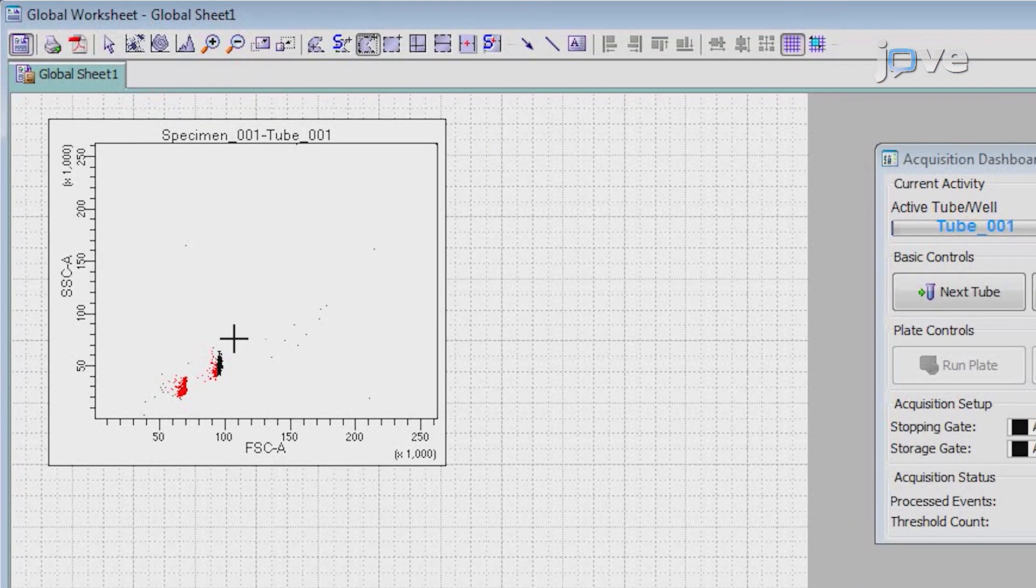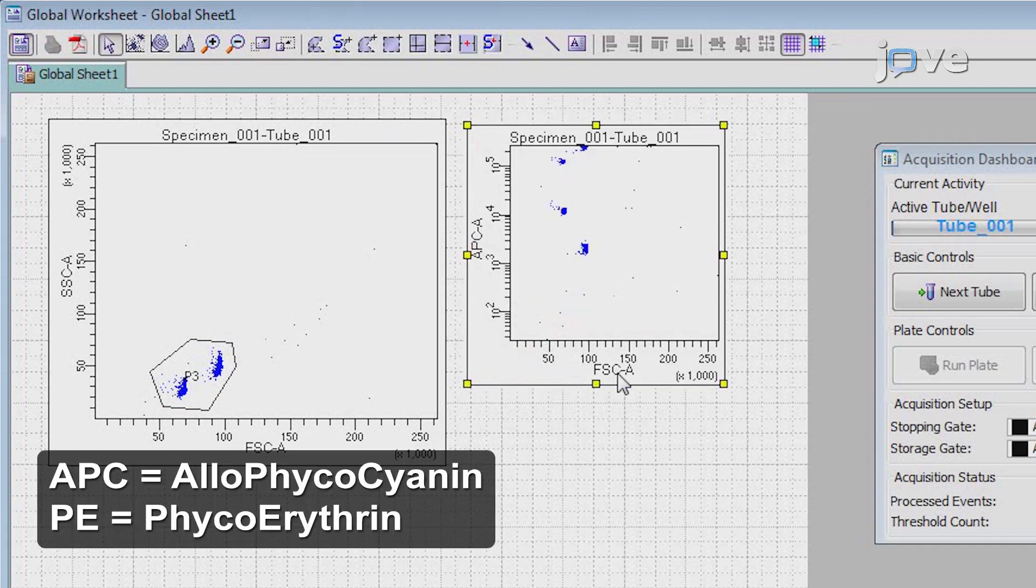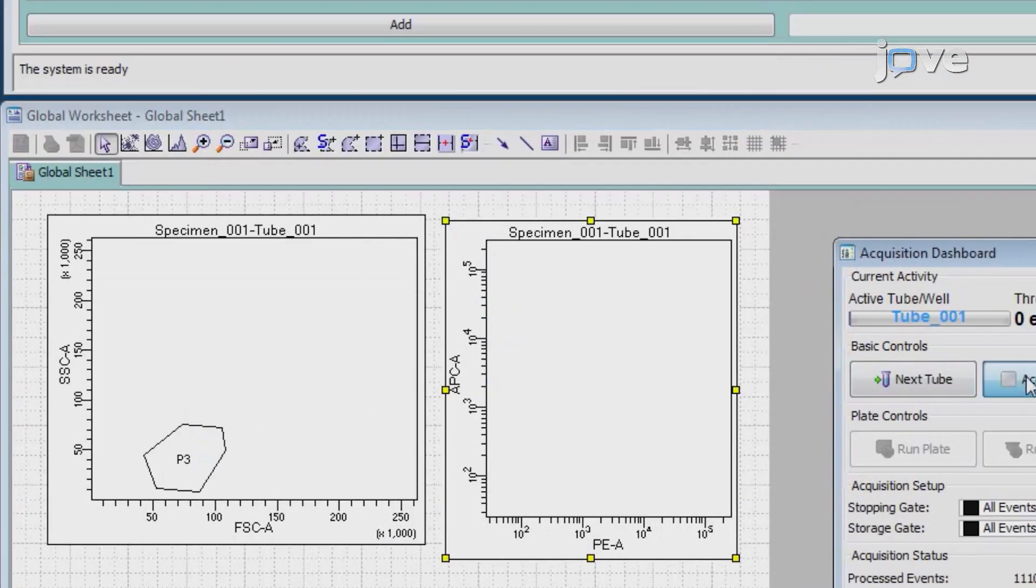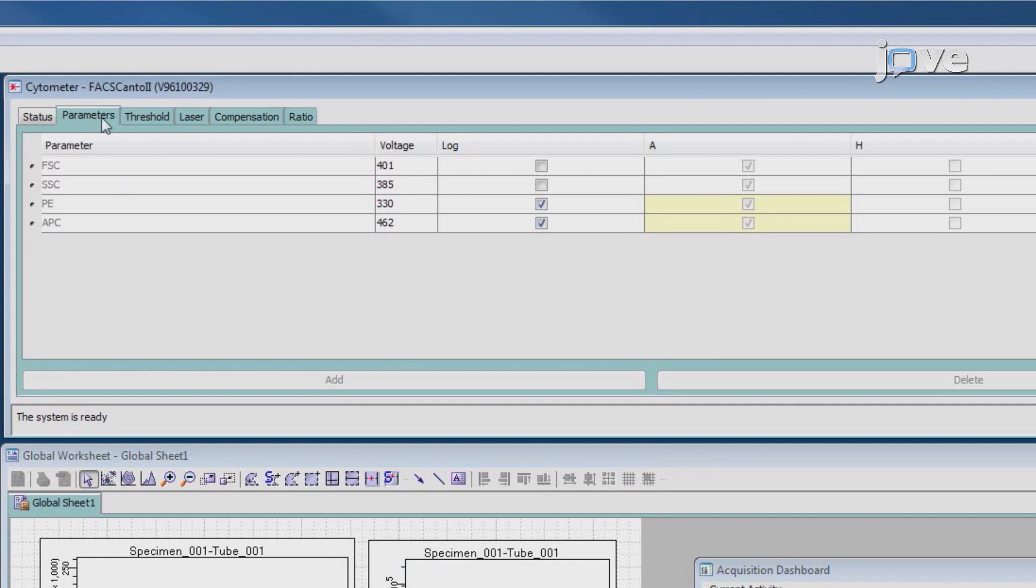In the forward scatter versus side scatter plot, draw a gate that includes all bead populations. Display the gated bead populations from the forward scatter versus side scatter plot on the second dot plot with PE on the x-axis and APC for the y-axis. Adjust the PMT voltage for the APC fluorescence channel so that the APC signal for all bead populations has a median fluorescence intensity, or MFI, that lies between 10 and 5,000.